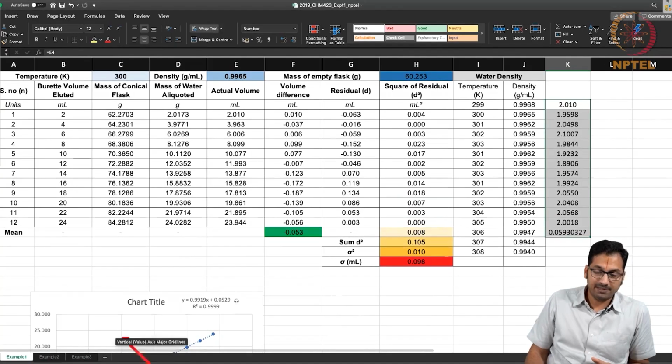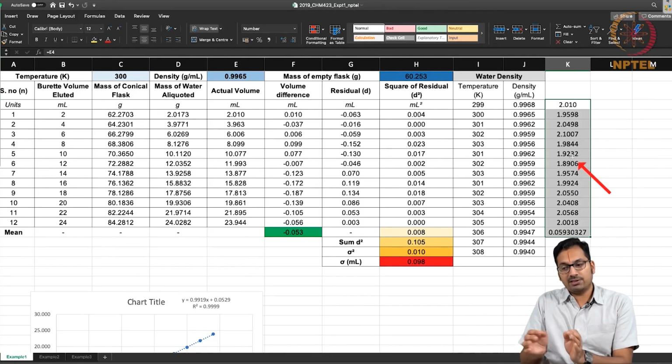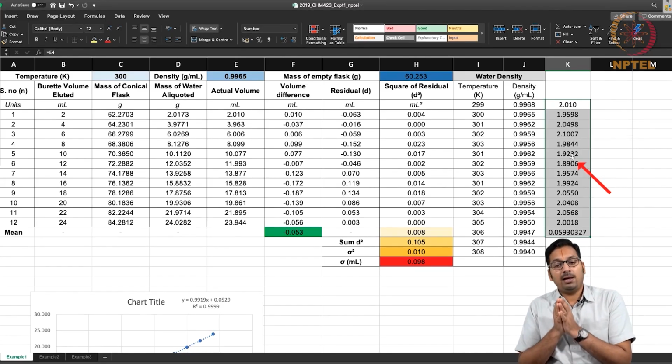On the other hand, if you look at the first researcher, when you wanted to measure 2 ml, you have values that are above and below 2 ml within a small error that comes up, an equal number of values above and below 2 ml. That helps you get a fairly accurate measurement as well.